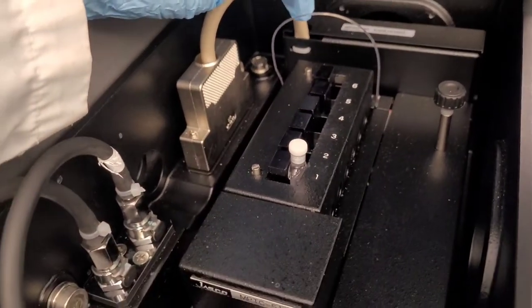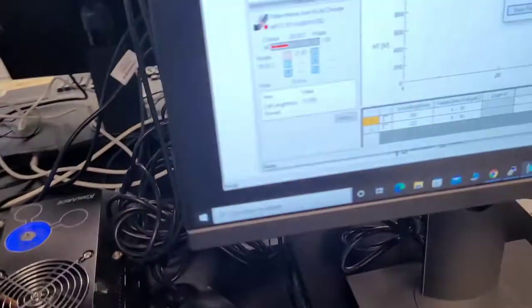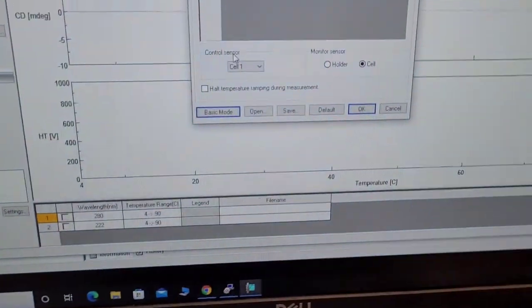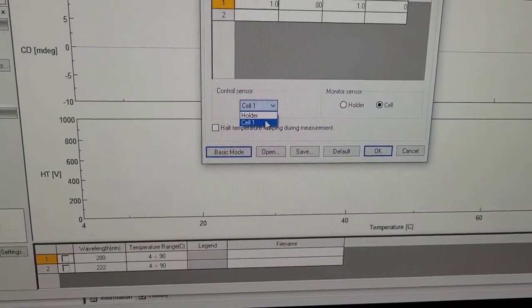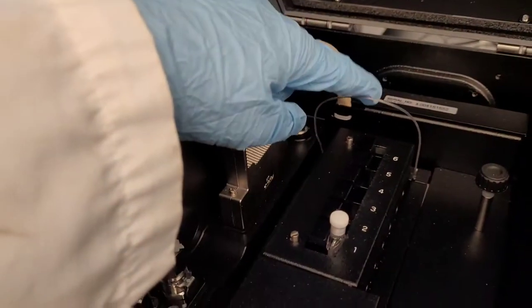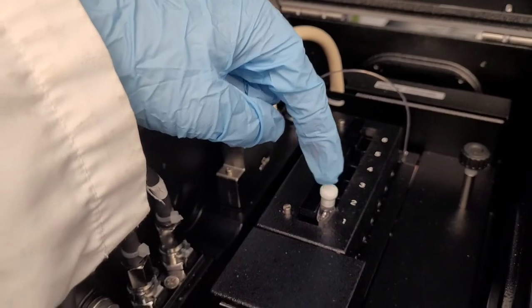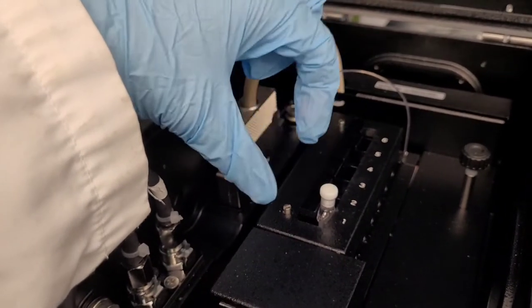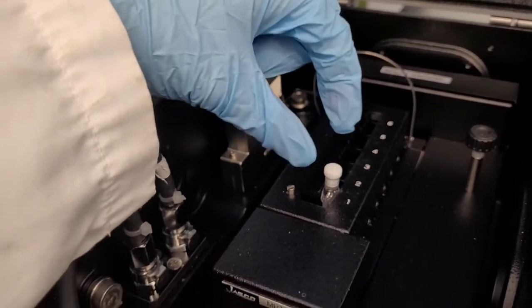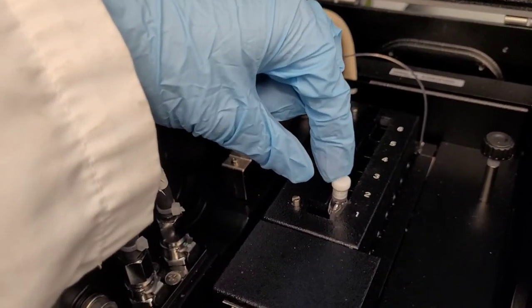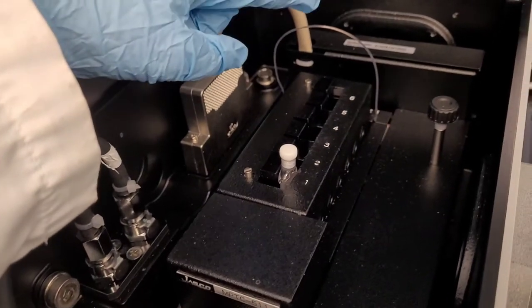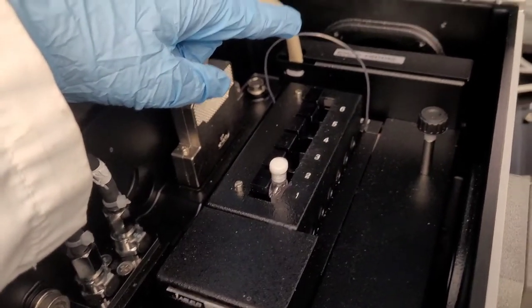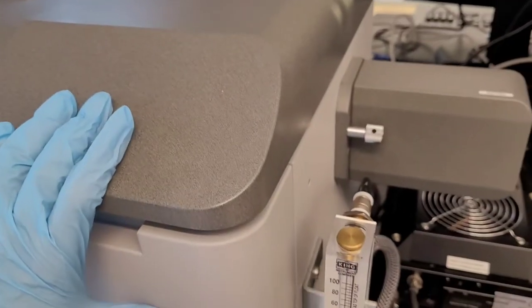And right now it is at the holder. If you wanted to measure from the sample, which would be cell one, you would have to put this inside the actual cuvette, but that's not necessary. The holder is usually good enough.